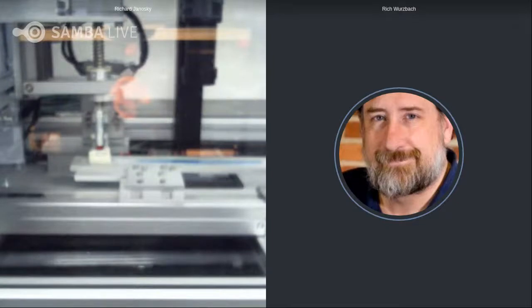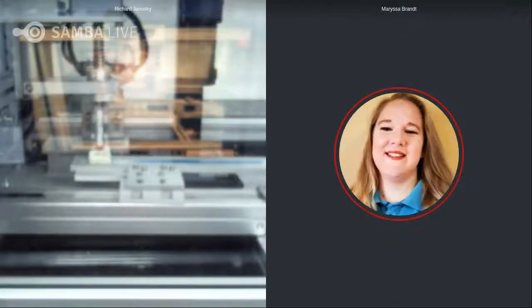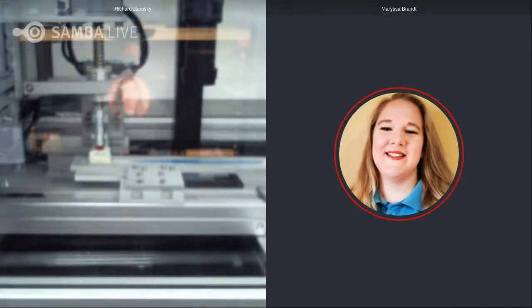All right, and our sample extrusion, sorry. Richard, can you hear me? Yes. Yeah, it looks like you're focused on the door on that one, so it's kind of tough to see. Can you maybe keep the door open or adjust the focus if you do a second one? Due to the safety feature, we are unable to open the door and run the extrusion at the same time.